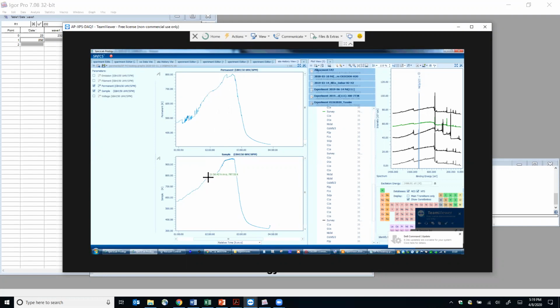We cannot do it here, but when we plot this in Igor, you will have the same x-axis. For example, in these 2 hours here, you will have a number, and we can know what the temperature in the manipulator is here. So you actually want me to plot it in the same graph? Exactly, the same graph. Sounds good.